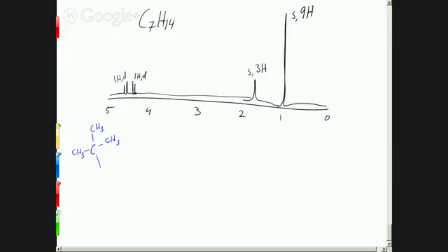All right, so we've got that. What do you think this 3-hydrogen singlet is? What kind of a group is going to give you a 3-hydrogen? Yeah, a CH3. So probably over here, another piece that we have is a CH3. So can we just put those two together and we've got our molecule? No, why not? Yeah, first of all, we don't have enough carbons and hydrogens here. And we also know that we need something else here that we haven't dealt with.